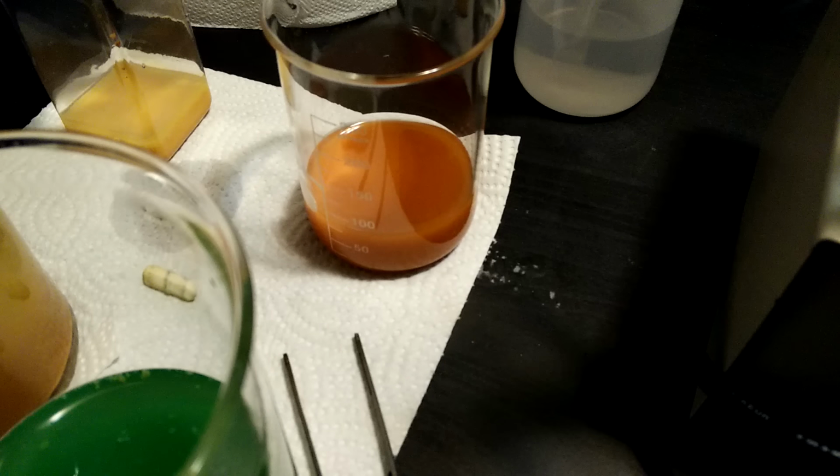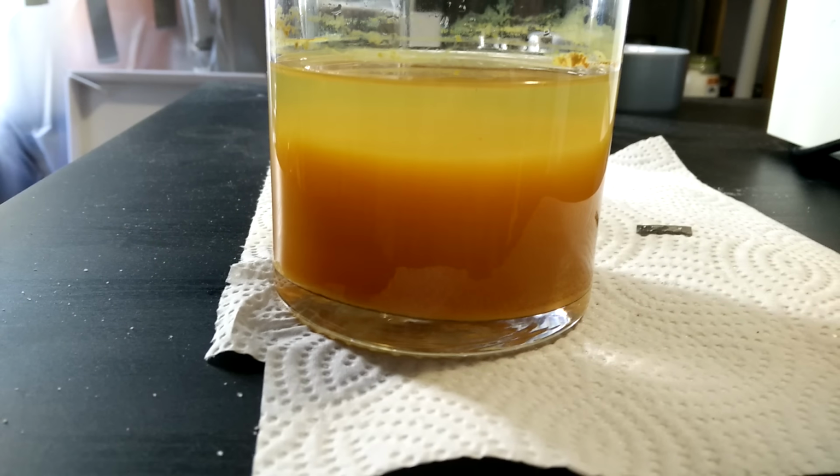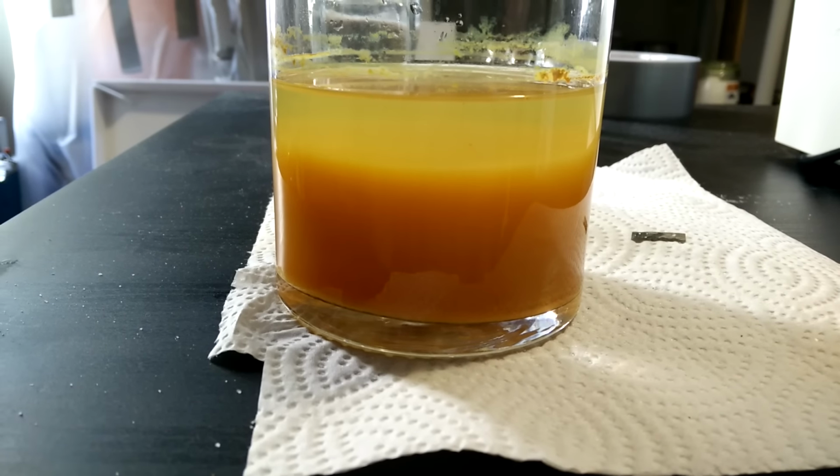The other reason, as I mentioned before, is due to size. During the washing steps I'll cover in a moment, the particles tend to agglomerate a bit, and the increased size shifts the color closer to red. The reason I say to aim for a canary yellow solution is because then you've got the best chance of not having any copper contamination in your mix.